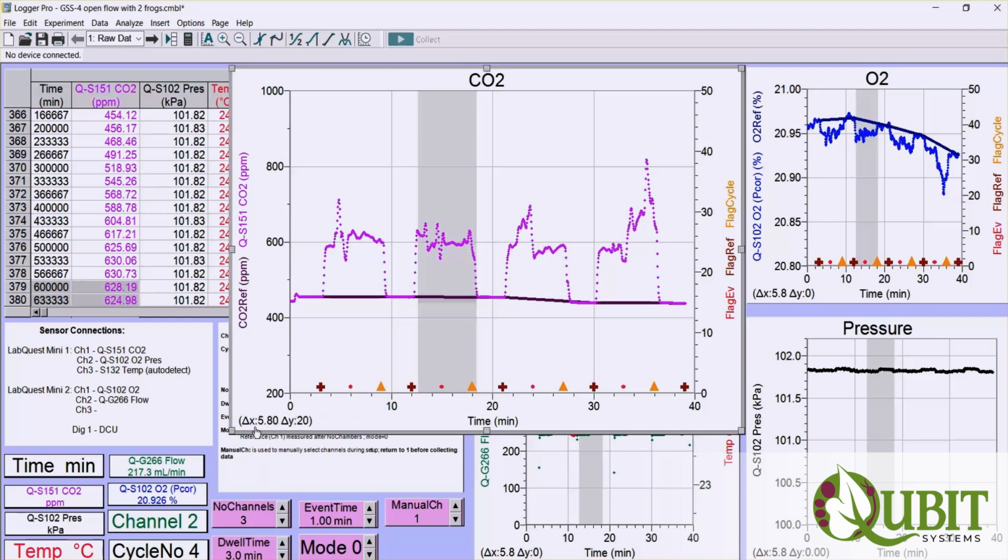One more thing to mention is that our oxygen analyzer measures oxygen in kilopascals. It also has a pressure sensor which measures absolute pressure at the site of the sensor, and then the kilopascals of oxygen measured are corrected for any changes in pressure, and the P-corrected data in percent oxygen is plotted on the graph, and it's shown in this meter as well and in the table.